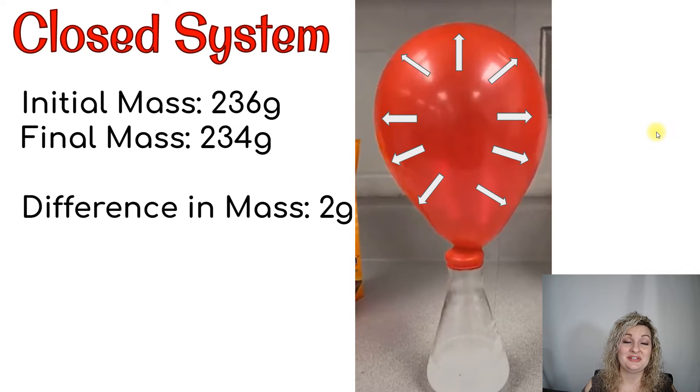Okay, so let's look at our closed system. We had an initial mass of 236 grams and a final mass of 234 grams. So we have a difference of two grams. Where in the world did it go? The law of conservation of mass says that it cannot be destroyed in this chemical reaction and I'm going to tell you it's still right there. I know this sounds weird because we just put it on the digital scale and it clearly did not say that, but it is.